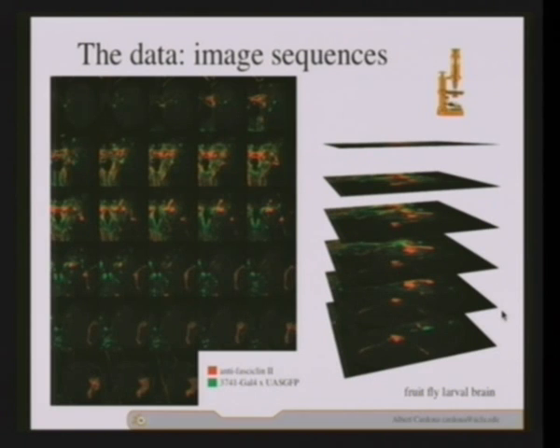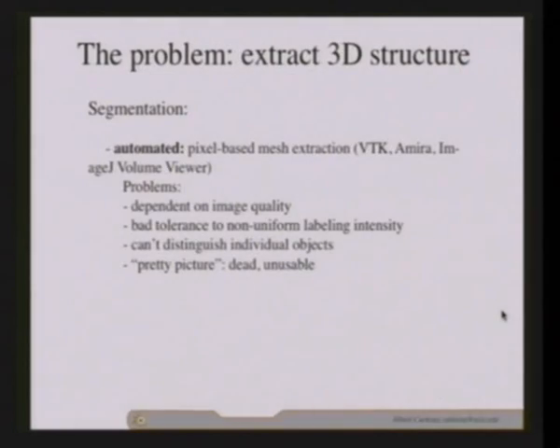So what I'm dealing with, what do I want to do with Blender? Basically, what I have is these stacked sequences of images. These images are optical sections of samples. So in this image, I have all the information that is describing my objects labeled in the sample. And now I want to extract the 3D from them. There are many ways to do this, but most of them have some problems. And so let's get into this.